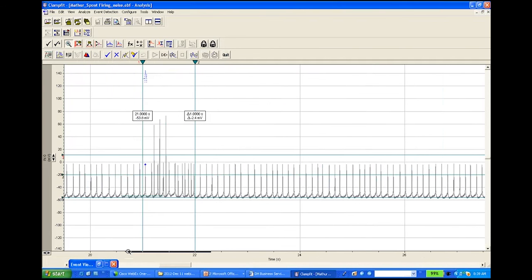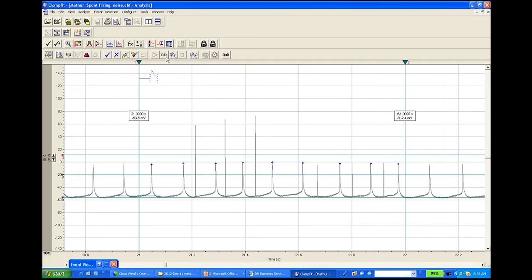All right, here. And then I click here. You can see this, because these 3 are rejected by the rejection level, and these 3 are rejected by the noise duration. All right? So I showed you the second method, how to reject noise and unwanted events.